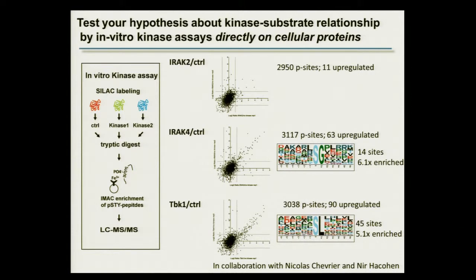In addition to those motifs, you also get from that assay the identity of your proteins of interest, because it's a full cellular lysate that you're analyzing. So it's a nice orthogonal assay to drug treatment data sets, for example, where you can cross-reference the phosphopeptides and phosphosites to see what is up and down regulated under certain conditions.